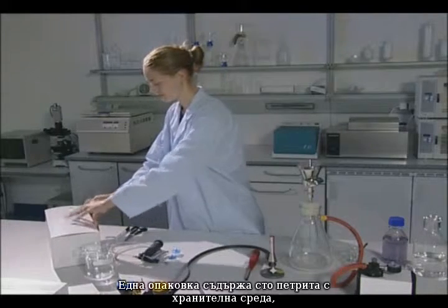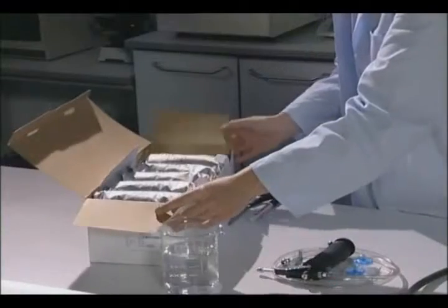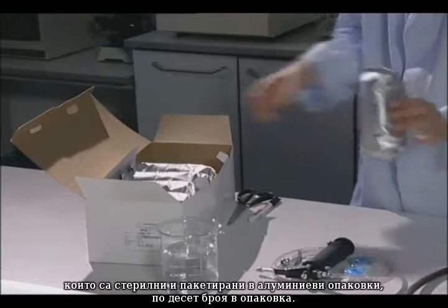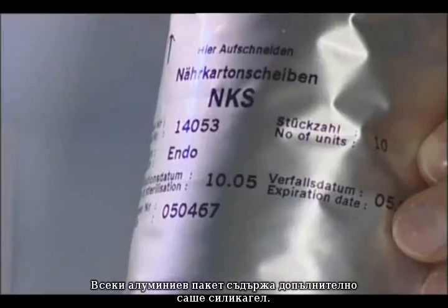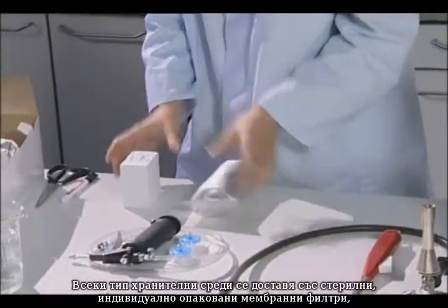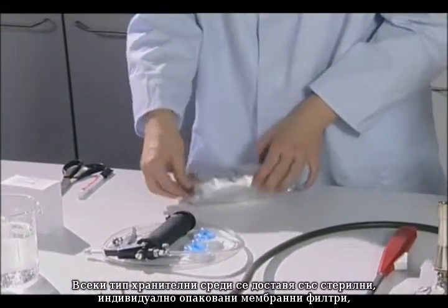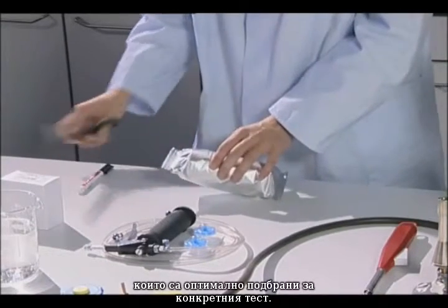One nutrient pad set package contains 100 sets, which are sterile and sealed in aluminum bags of 10 units each. Each aluminum bag additionally contains a silica gel sachet as desiccant. Each type of nutrient pad set is supplied along with individually sterile packed membrane filters that are optimally suited for the specific test.